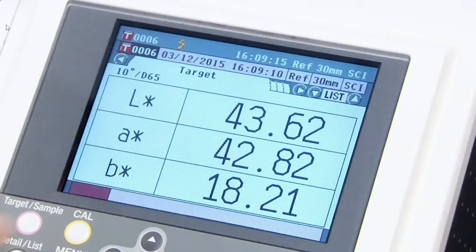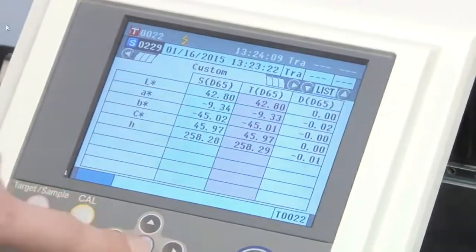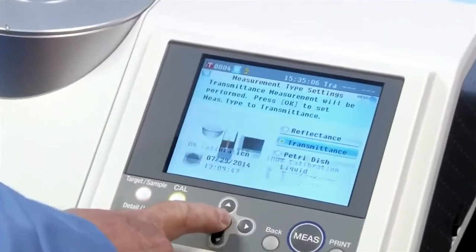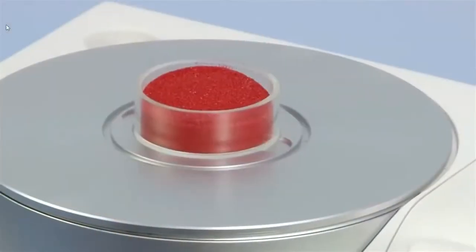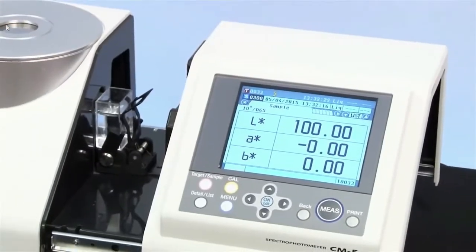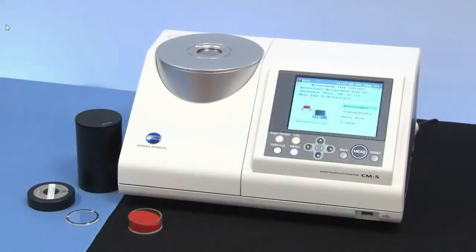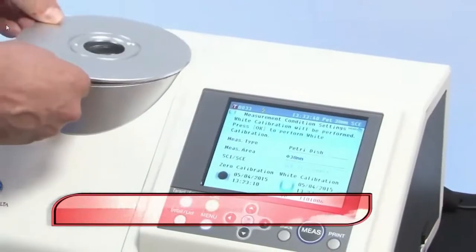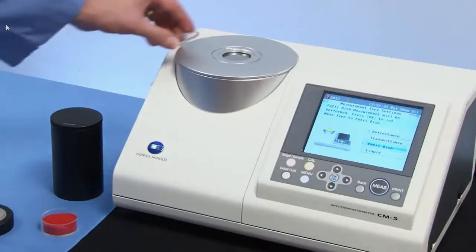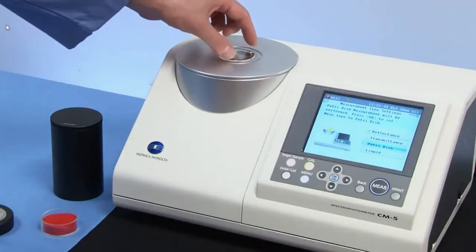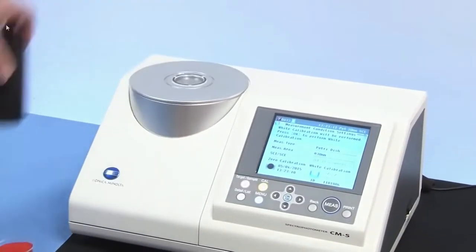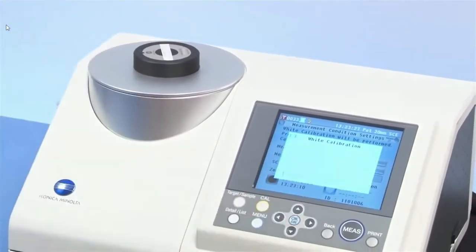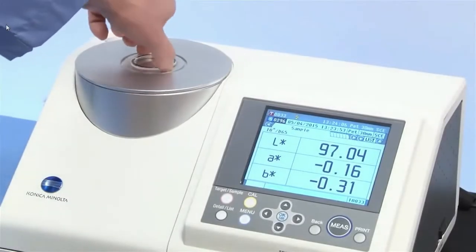Configure the CM5 to your measurement requirements including petri dish and liquid modes. To perform a reflectance measurement in petri dish mode, put the special target mask in place followed by the glass accessory piece. Perform zero calibration and then an external white calibration through the glass piece. This will normalize the instrument when measuring samples through a petri dish. Proceed to measure your targets and samples in reflectance mode as normal.